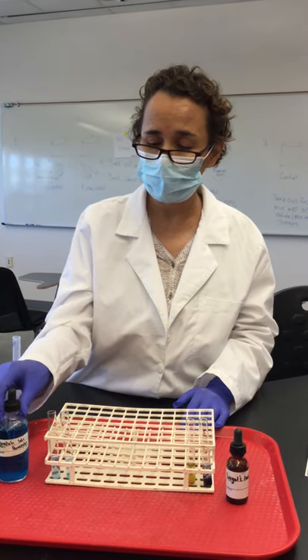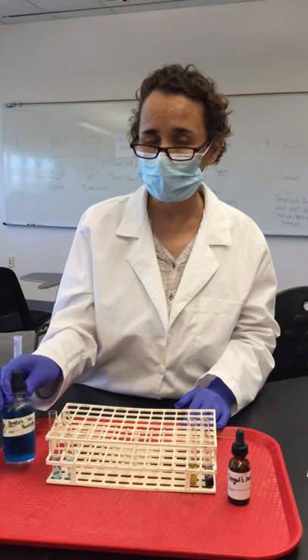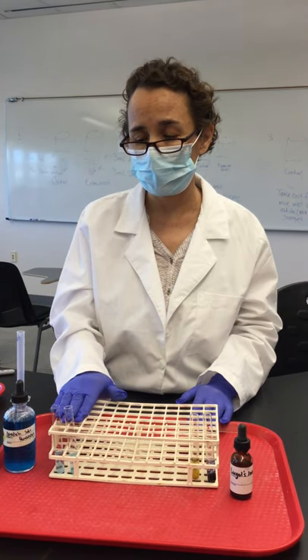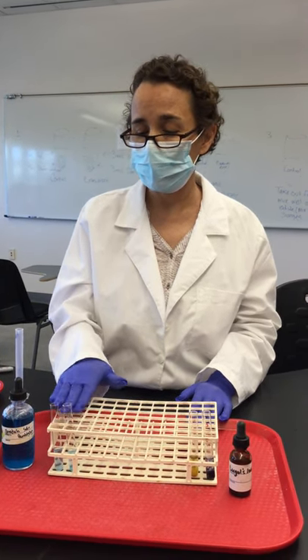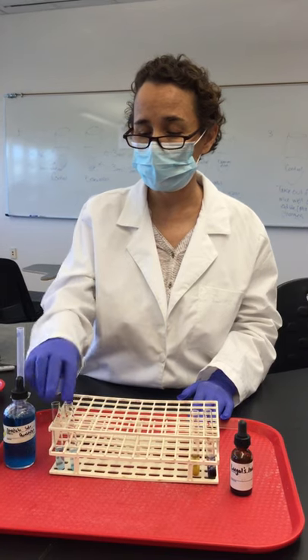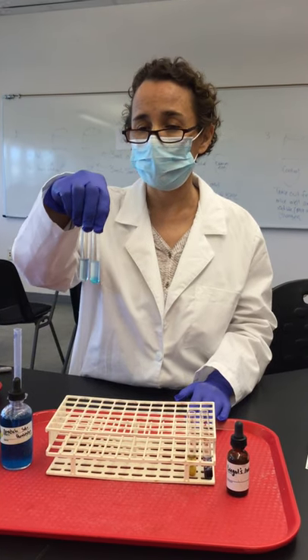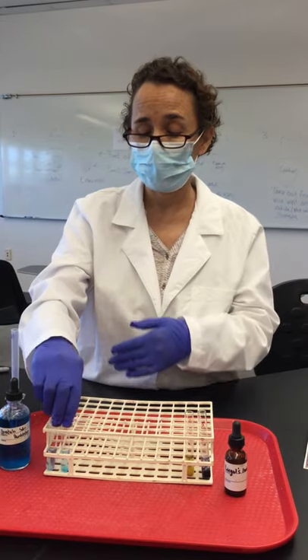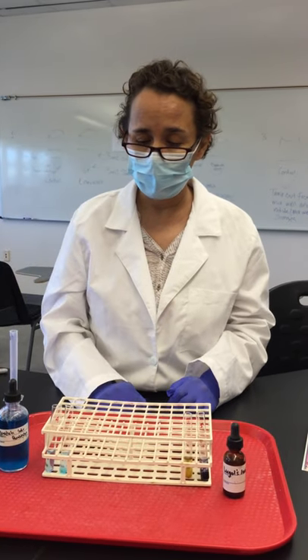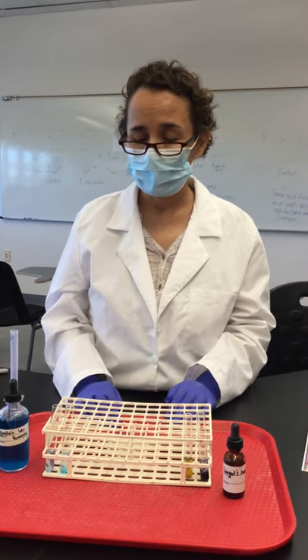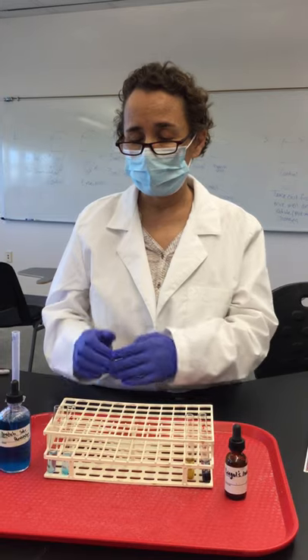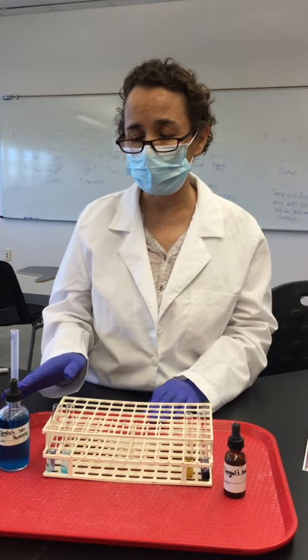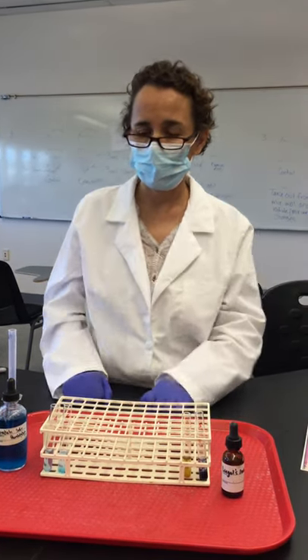The Benedict's reagent detects the presence of monosaccharides or glucose. To see the color change — which currently appears blue — we need to place the tubes in boiling water. I'm going to do that now and will be back to show the results.